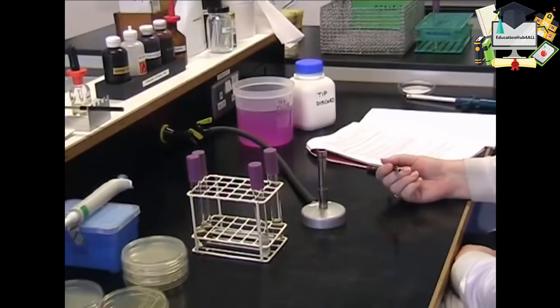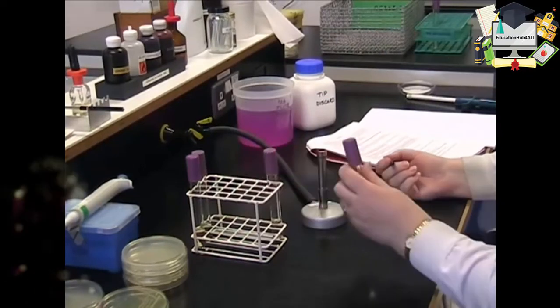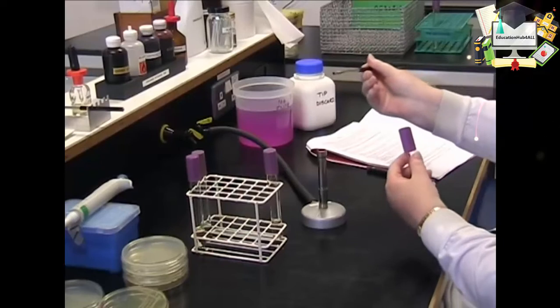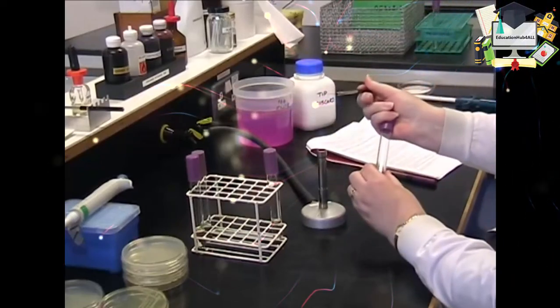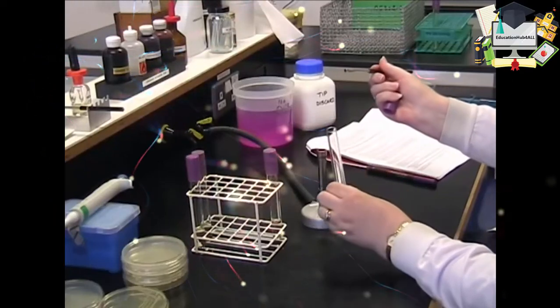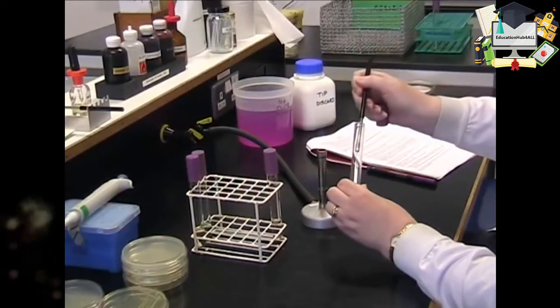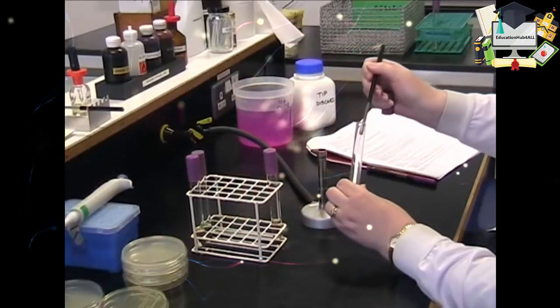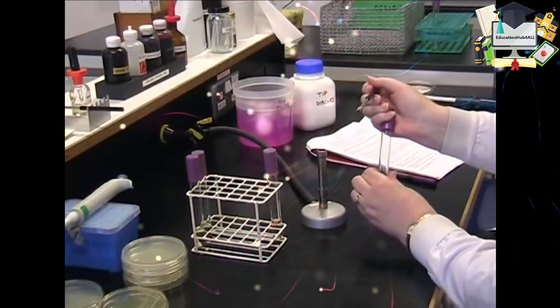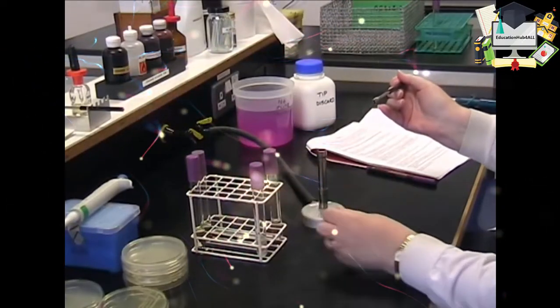I'm now going to show you how to inoculate from a broth culture. Take your pre-grown broth culture and having a flamed, cooled loop in your right hand, place the lid of the test tube in your small finger. Remove the lid of the tube and flame the neck of the test tube. Place your loop into the broth culture and collect a loopful of culture. Flame the neck of the tube and replace the lid. Always make sure you put this back in a rack to avoid any spillages.